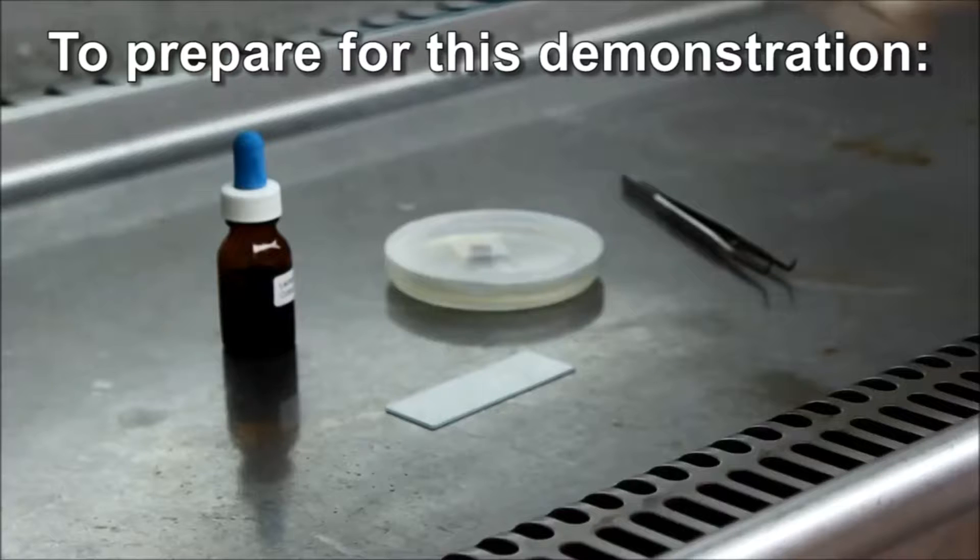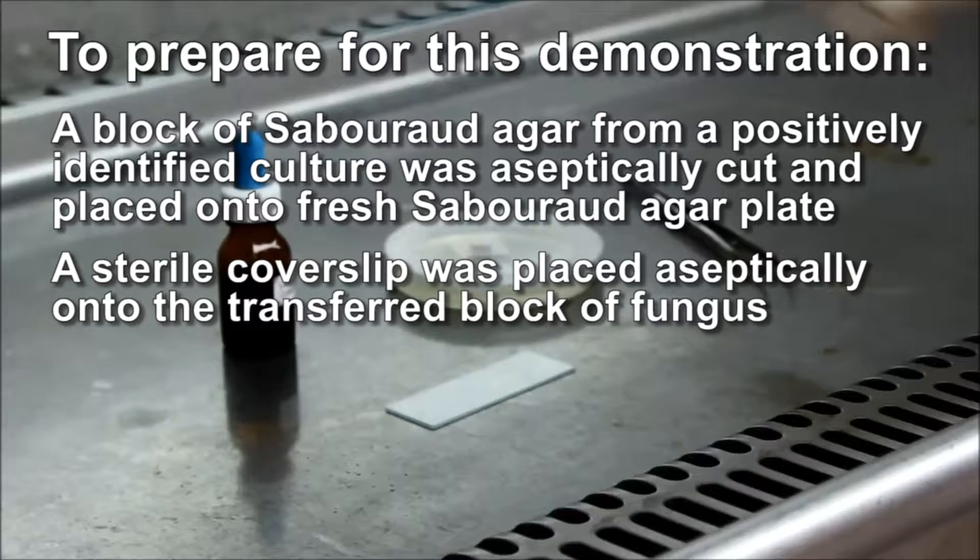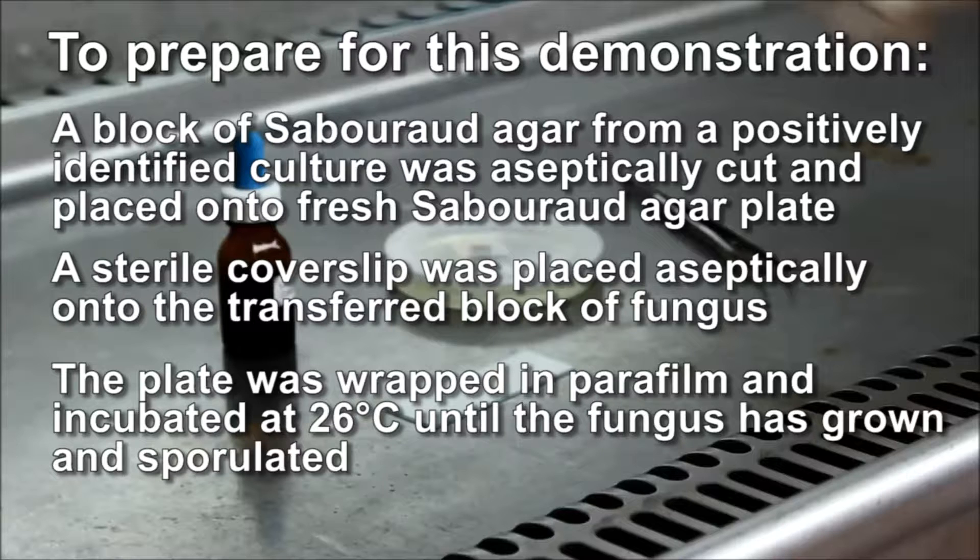To prepare for this demonstration, a block of Sabouraud agar from a previously positively identified culture was aseptically cut and placed onto a fresh Sabouraud agar plate to grow. A sterile coverslip was placed aseptically onto the transferred block of fungus. Mycelia and spores attach to this coverslip as the culture grows. The plate was wrapped in parafilm and incubated at 26 degrees until the fungus had grown and sporulated.